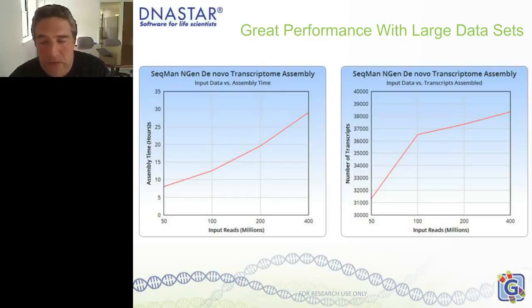Sometimes it's fragments of transcripts or rare isoforms, or sometimes it's some other kind of contamination. But for most folks, around 100 million reads, you generally get nice coverage of your transcriptome, and you can see that it really does plateau at about 100 million reads. So it's just something to keep in mind as you're generating data. You may not need an excess of data to get all the coverage that you actually need or require.